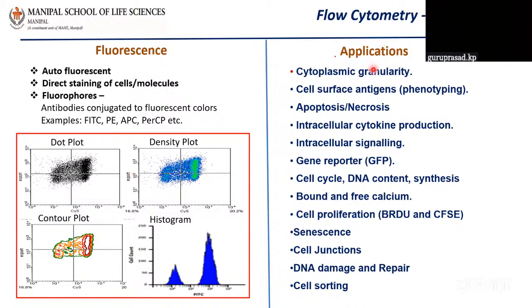And you are treating the cells with, say, a nanoparticle. You want to make sure whether the nanoparticle has entered the cell. If the nanoparticles have entered the cells, what actually happened to the cells? The granularity of the cells increased. So if you have an SSC plot on the x-axis, and the cell has moved towards the positive side of SSC, that clearly indicates that the cell is granular. So the cell moved from an agranular state to a granular state, which means nanoparticles have entered the cell.